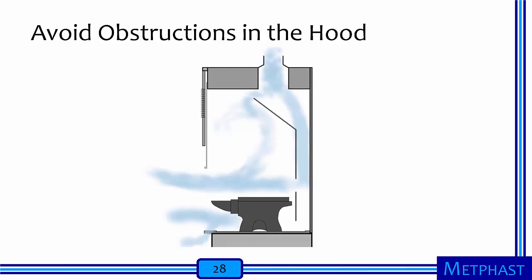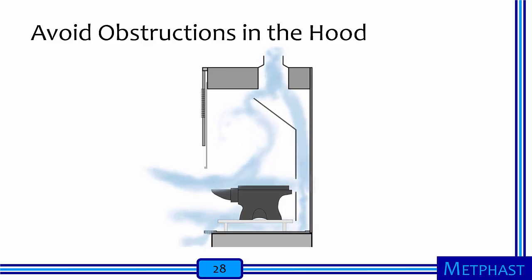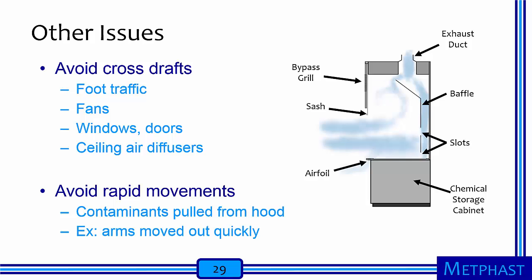Avoid placing unnecessary items in the fume hood for storage, as these can obstruct proper airflow from the front to the rear slots. Use a small table or shelf to elevate necessary items and allow air flow under the table. Never place anything on top of the airfoil or directly in front of the rear slots. When using a chemical fume hood, avoid cross drafts such as those from foot traffic, fans, windows, doors, or ceiling air diffusers, as drafts can dramatically change airflow patterns and cause contaminants to escape into the room. Also avoid rapid movements such as rapidly pulling your arms out of the hood, as such actions can also allow contaminants to enter the room.